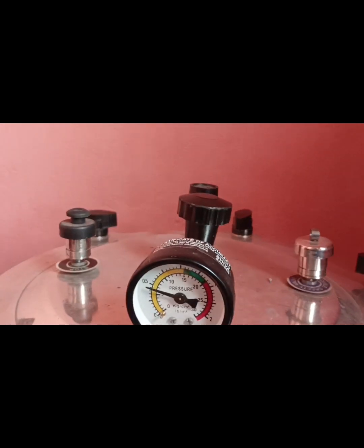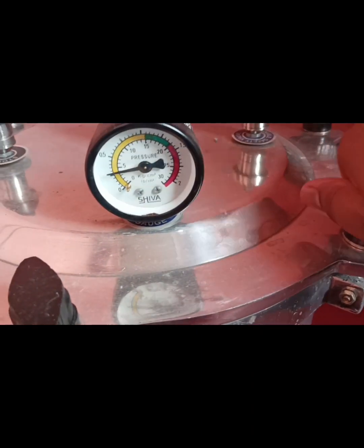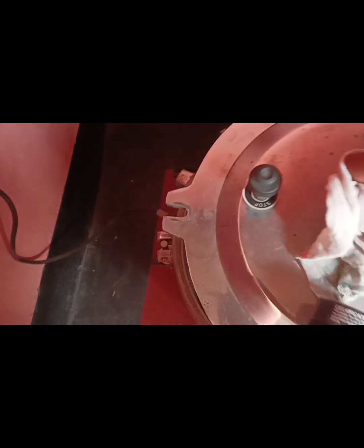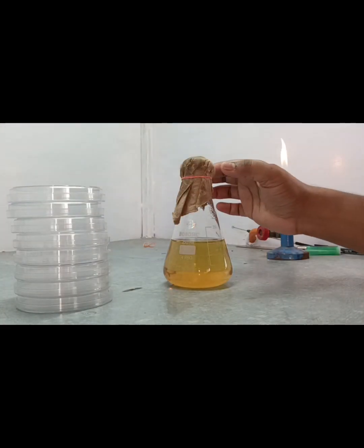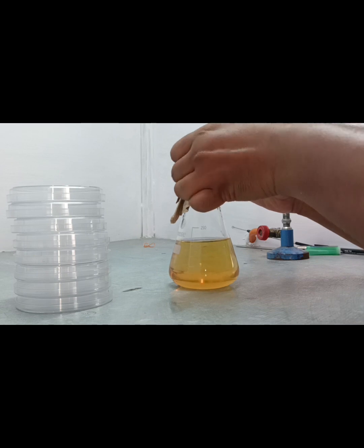Release the switch. After that we open the autoclave lid carefully after the autoclave process is complete. We then have to pour-plate the Mueller Hinton agar solution into petri dishes.